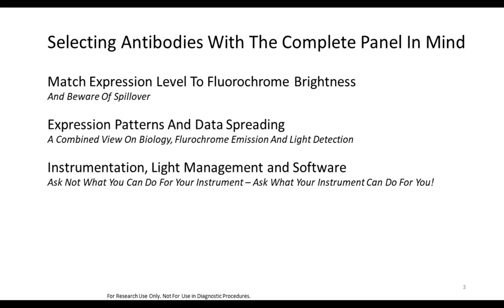So, here we are today, and we'd like to really focus on why it isn't always advantageous to use the brightest dyes for every marker in a panel. How do you then incorporate the instrument characteristics into your panel design? And then, also demonstrating how you can apply good panel design in a way that helps both really new to flow cytometry users as well as advanced users, and how it makes it easier for you then to communicate how you've made decisions on how you put your panel together, and then also learning some things about technology and how the technology really can influence the decisions that you make when developing a multicolor panel.